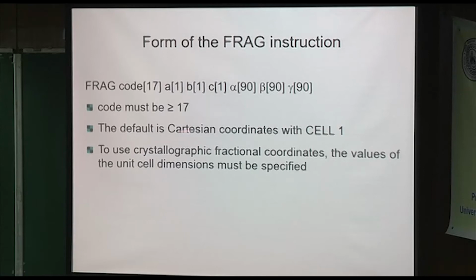Then how do you get the Cartesian coordinates? Well, I think XP does a nice job, because in XP you can just say orth and then give a file name like c60.ort, and that's Cartesian coordinates. So ORTH in XP gives Cartesian coordinates. I'm not sure what WinGX does about it, but it's probably in there somewhere. Okay, so if you're using the crystallographic coordinates, you have to put in ABC, alpha, beta, gamma.